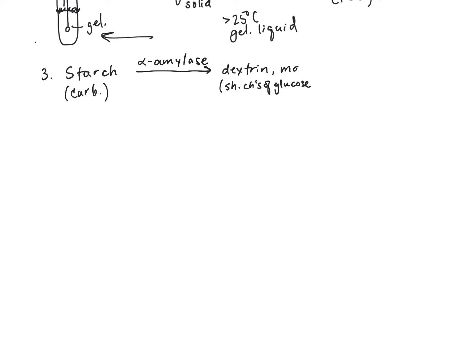Maybe some maltose, which hopefully you remember is a disaccharide made of 2 glucose units, and maybe some individual glucoses as well. All right, so again, we're hydrolyzing that starch. We're going to inoculate starch agar, using the 4-quadrant technique. Once again, this is the plate that looks kind of like nutrient agar, so you might want to just label that so you remember what that is.